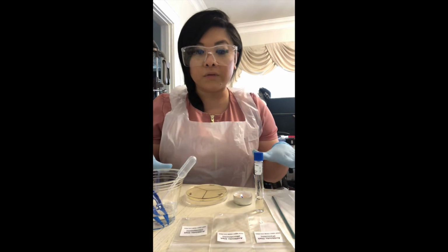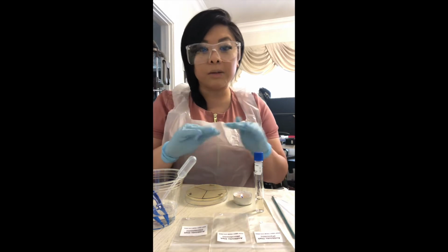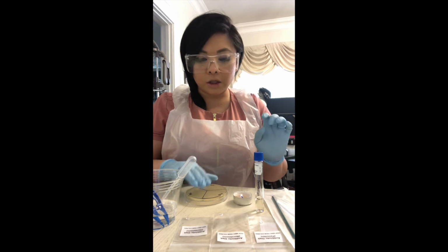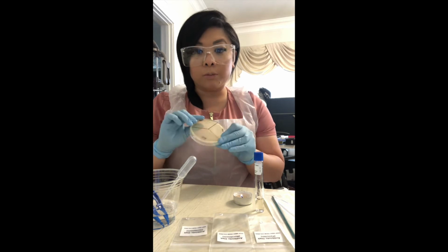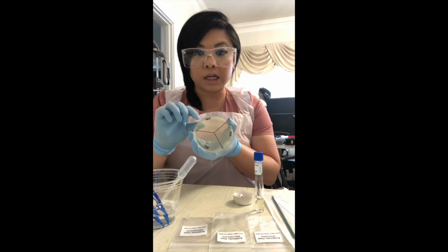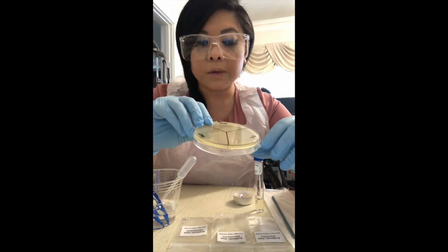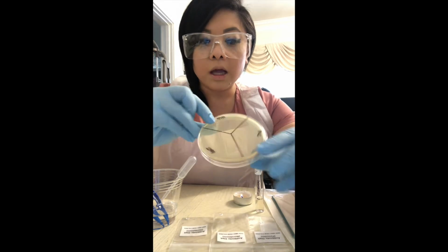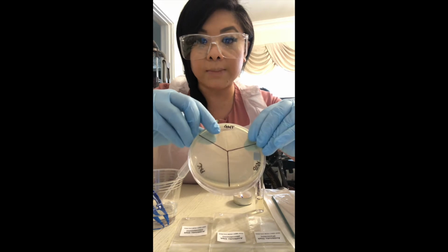I've cleaned my surface with 10% bleach solution, and then I have all my materials listed for this experiment. Next, I already used a permanent marker, and I already poured my agar plate yesterday to prepare for this experiment. With a permanent marker, I created 3 sections, which are labeled with the corresponding antibiotic. So this is going to be NVB, which stands for novobiocin. PNC is for penicillin, and GNT is for gentamicin.